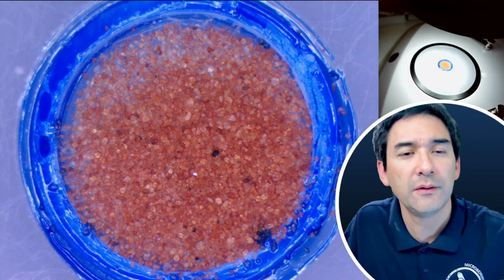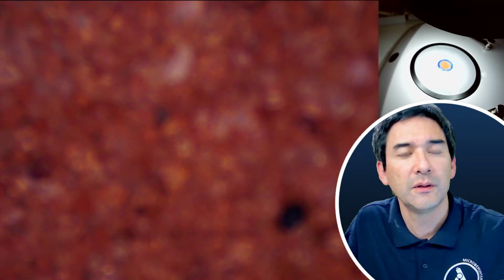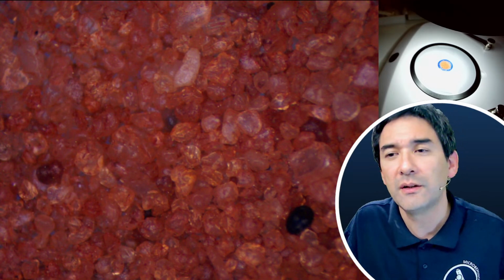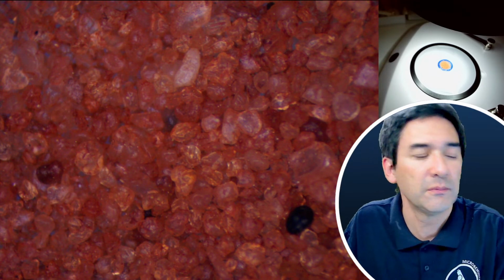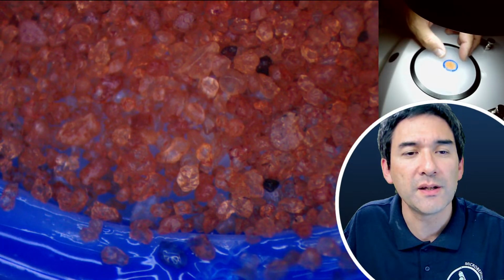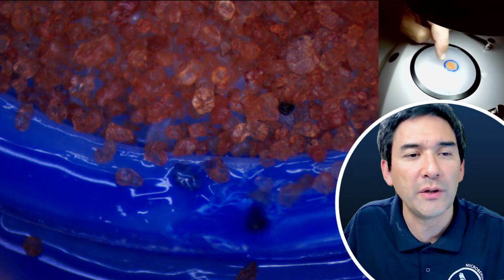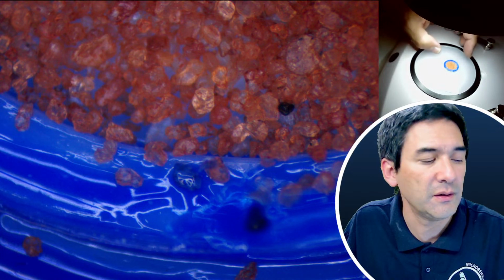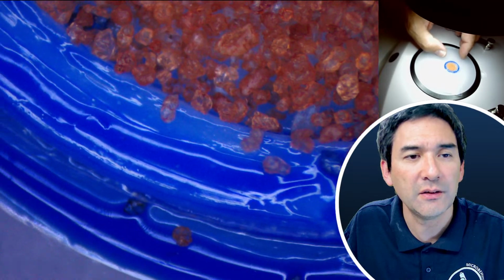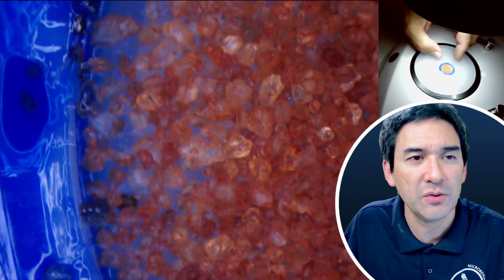Focus in a little bit, yeah, and yeah, microscope not properly adjusted. That's why I have to refocus. And this is basically the sand grains. Okay, you see some of the sand grains managed to actually go now into the nail polish here, and they might prevent a good contact. Okay, so you see that this can also be used as quality control.